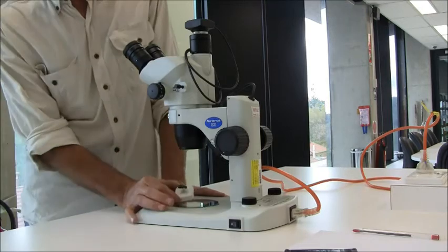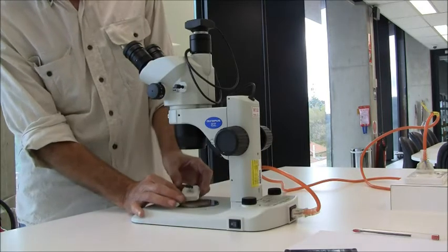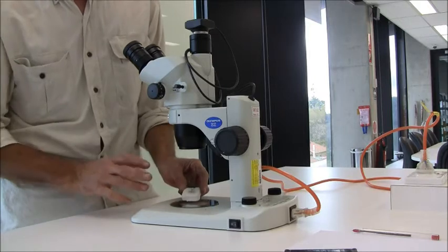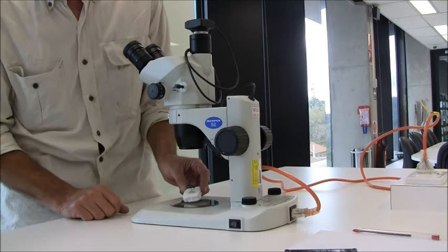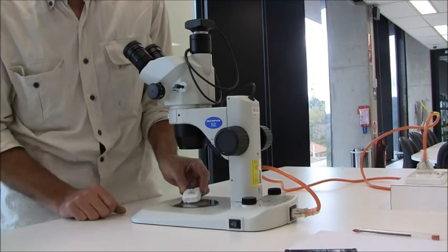It's called a dissecting microscope because you can do dissections under it. It doesn't magnify things very strongly, but you can certainly see details on specimens like insects. In fact, a lot of detail.